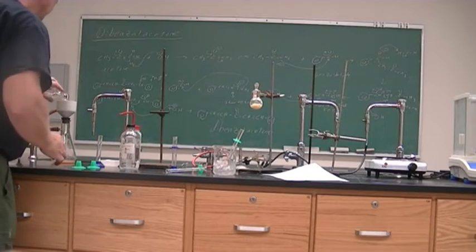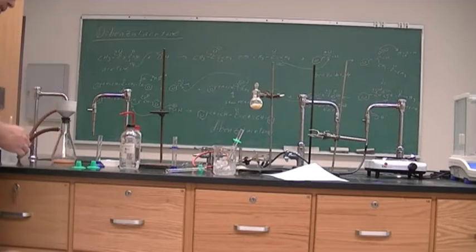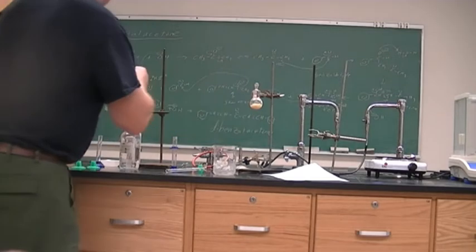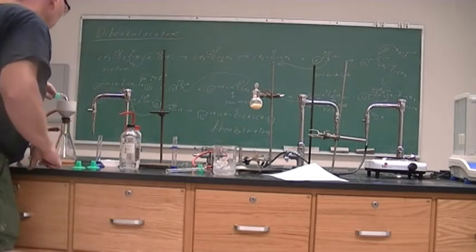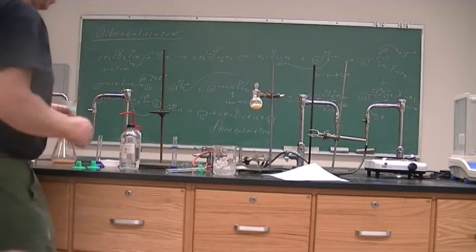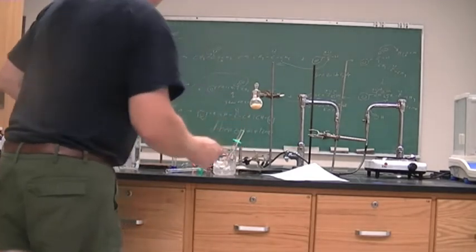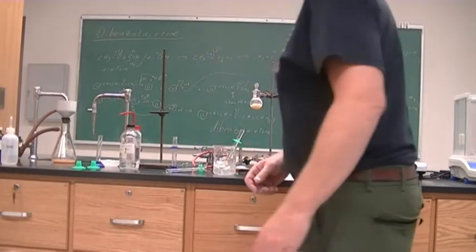Rinsed out the flask pretty well with some water. Alright, so then I'm going to wash it with some cold 95% ethanol.